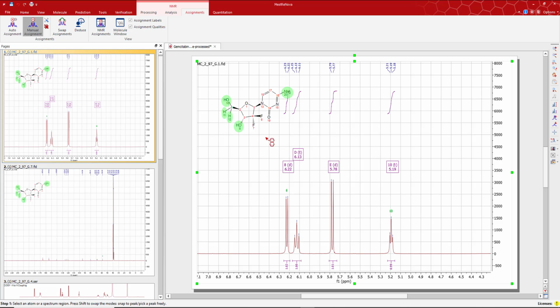So now that I have my heteroatoms assigned, I have my diastereotopics assigned, and because I'm fortunate enough again to be doing this in dry solvent where I see coupling from the protons to the protons in the ring, we can start finding the proton signals here in the ring, so numbers 2, 3, and 5. Since we just found proton number 8, this OH, I'm going to use that to find the proton on carbon 3 and also to then find the carbon on number 3.